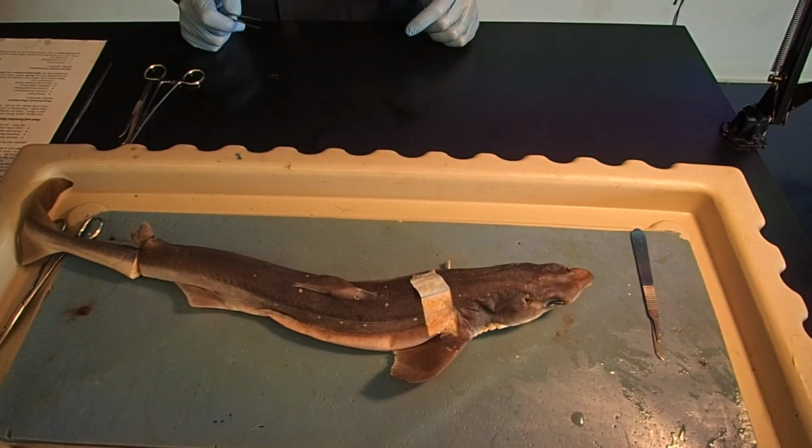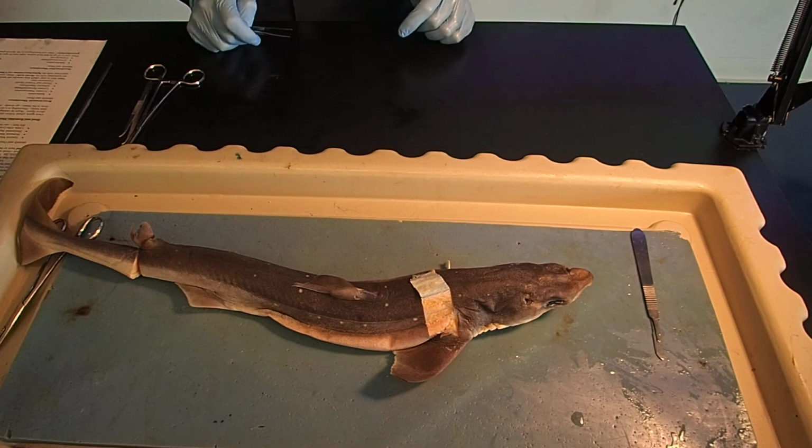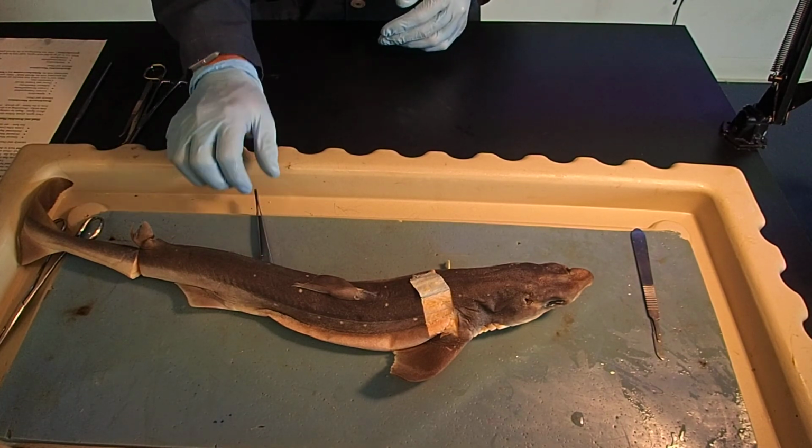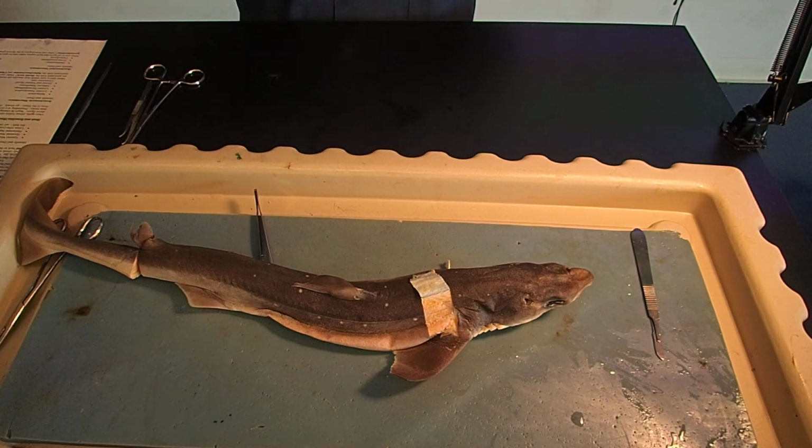And that does it for all of the muscles dealing with the trunk. Next, we'll move into the head and the branchial muscles. These are going to be a little bit more fine scale, smaller, and so we're going to want to really zoom in on those in just a little bit.